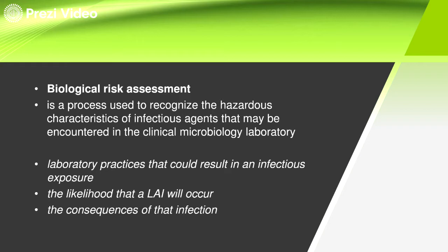So, unang-una muna, you must recognize what are the different lab practices that can result in infectious exposure. So, ano yung mga ginagawa sa lab? Ano yung SOP natin? Another thing is that, what is the likelihood that a lab infection will occur? So, ano ba yung chance na pwede kang magkaroon ng sakit? Diba? Definitely, kapag mataas ang concentration ng infectious microorganism, and then, if you are not following the safety procedure, definitely makakasakit ka. And what is the consequence of that infection?